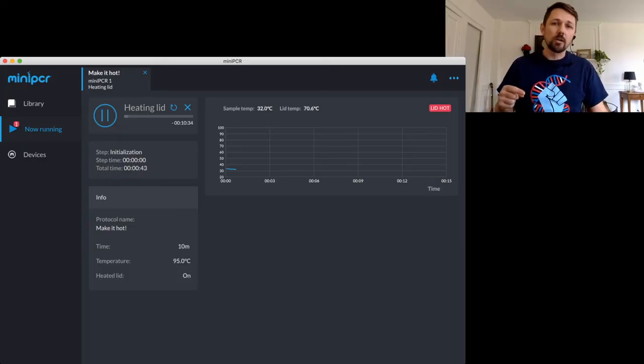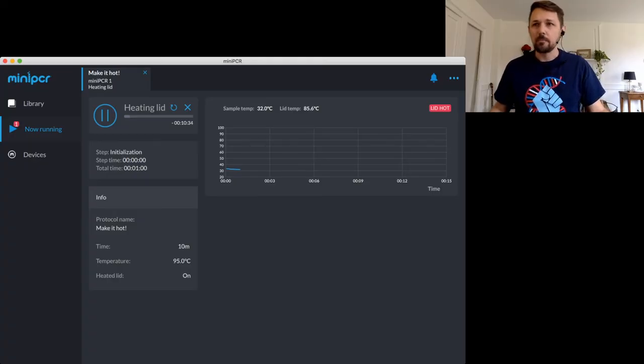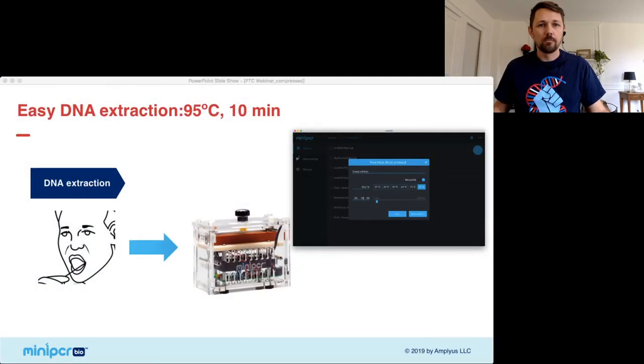If you do a much more complex DNA extraction, you're probably going to get much more pure DNA at the end. But for what we're going to do, it doesn't matter. So we can do this in 10 minutes. And you're much less likely to have an error because there's only one pipetting step and a 10-minute incubation. Okay, so we're getting out our DNA.